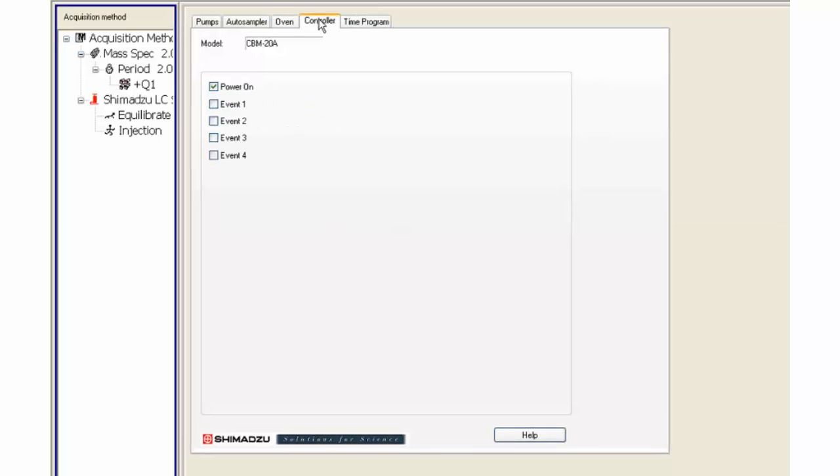Click on the controller tab. For simple use, only the power on the box needs to be checked.